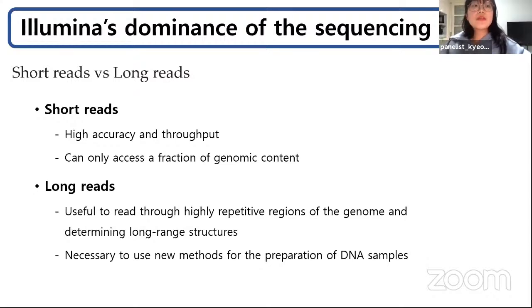However, short reads can only access a fraction of genomic content because genomes are substantially repetitive and much of the information in the genome is encoded at long scales.